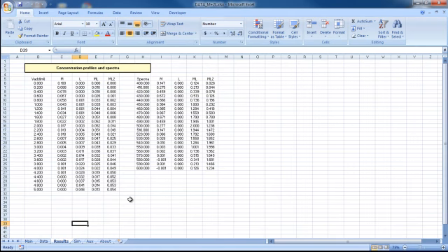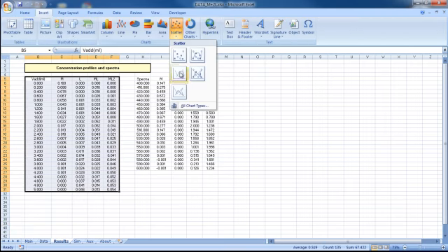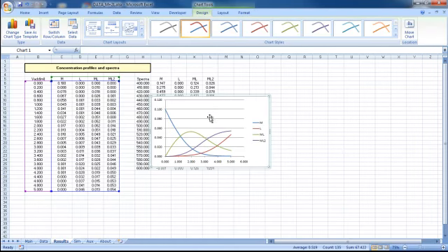It is now, of course, possible to use standard Excel tools to further manipulate the results or to create specific charts and graphs. This, of course, does not require ReactLab, and so can be carried out on any PC with Excel installed. The ReactLab workbook is therefore a complete and portable snapshot of the analysis session.